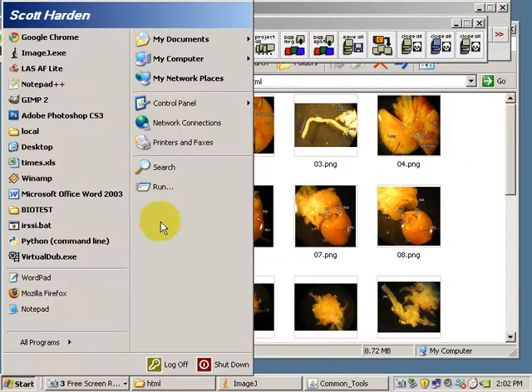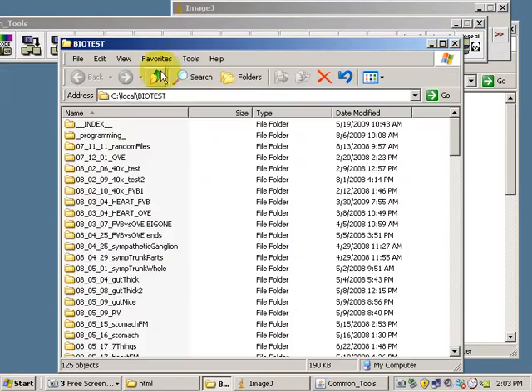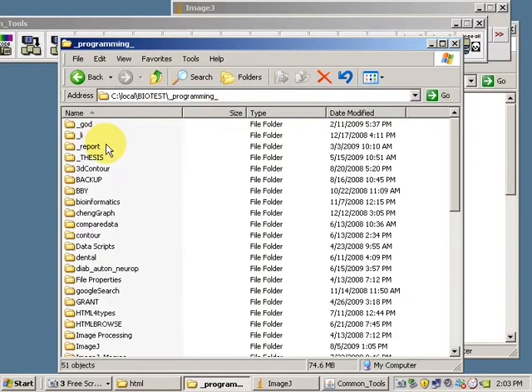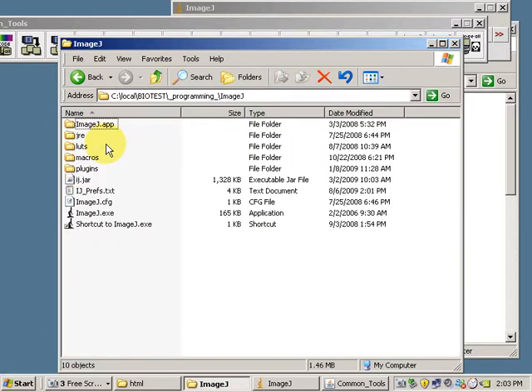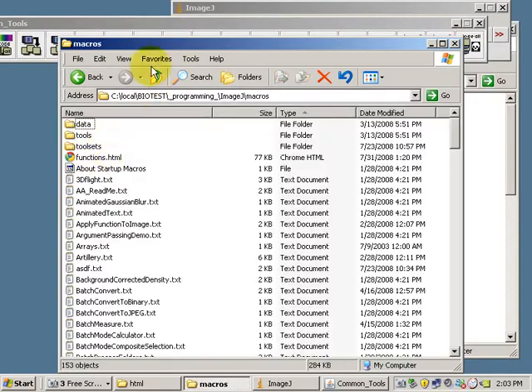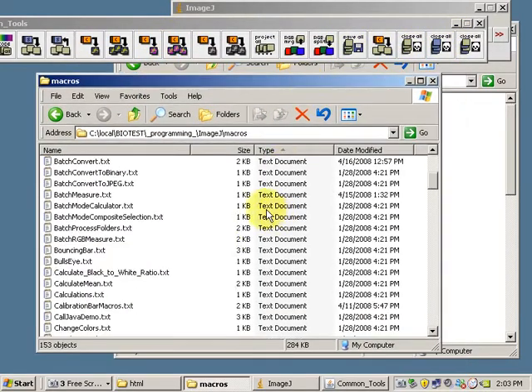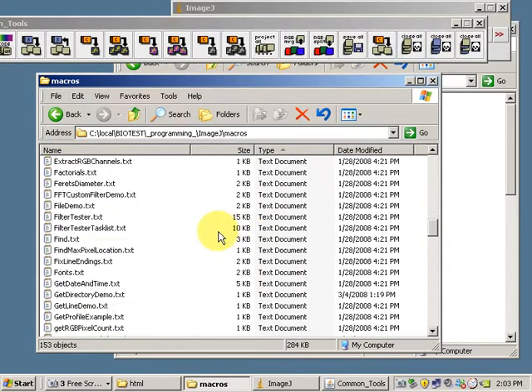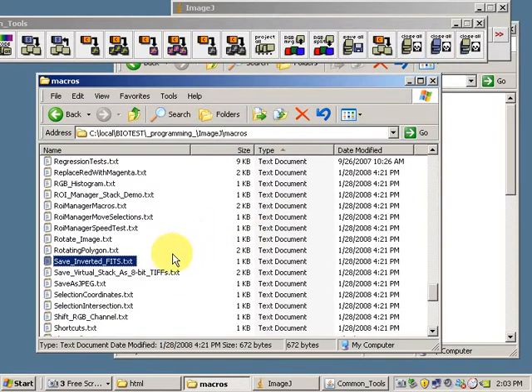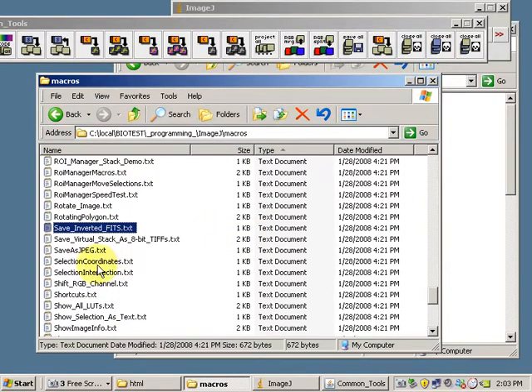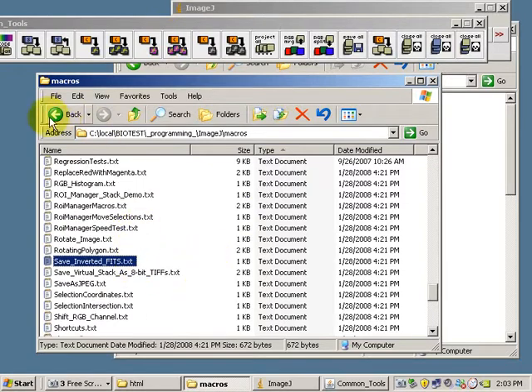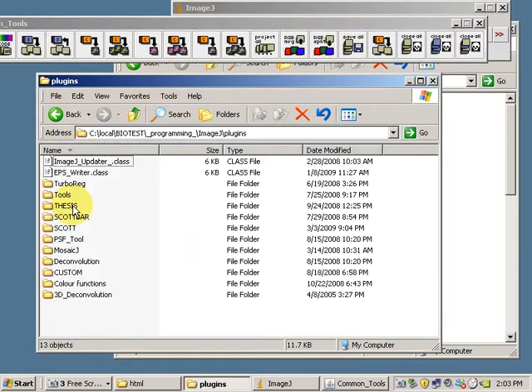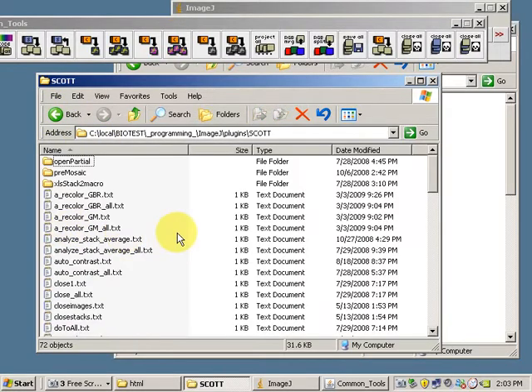I will open up the folder which contains ImageJ. Here's ImageJ. I'm going to go into the Macros folder, and I happen to know that the SaveAll macro is one that I wrote. It's here. Actually, SaveAll. It's actually under Plugins, Scott SaveAll.